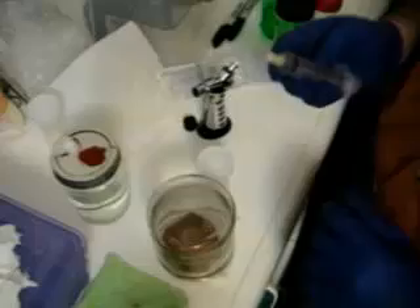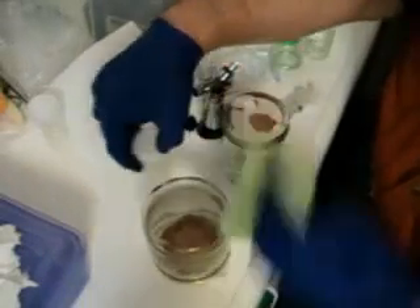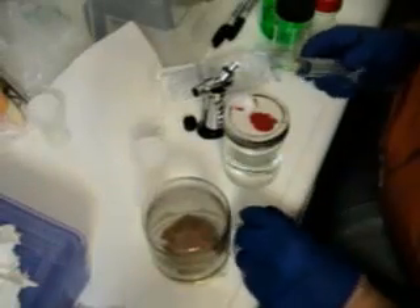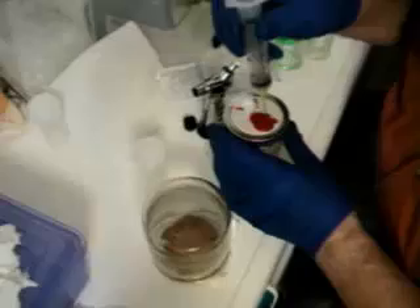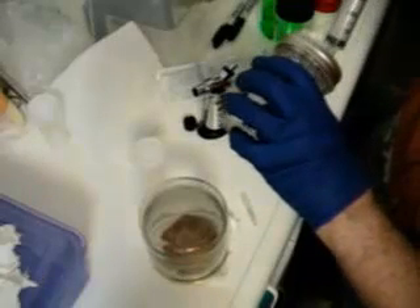The first thing you're going to want to do is take your rubbing alcohol and clean the self-sealing port. I'm probably going to wipe that needle down too. And you want to fill your syringe with sterile water.